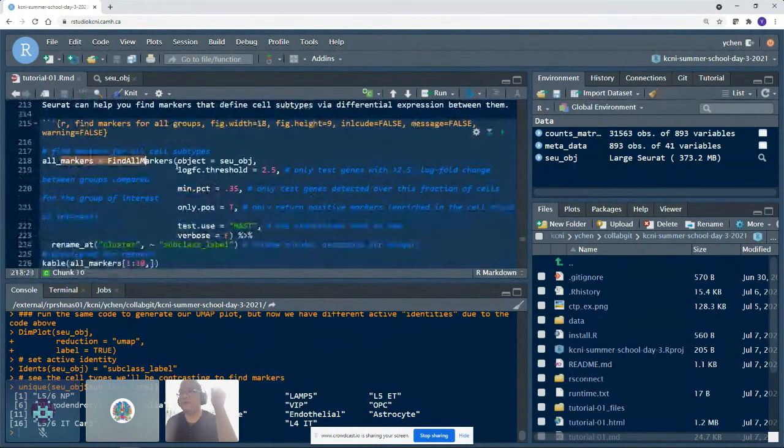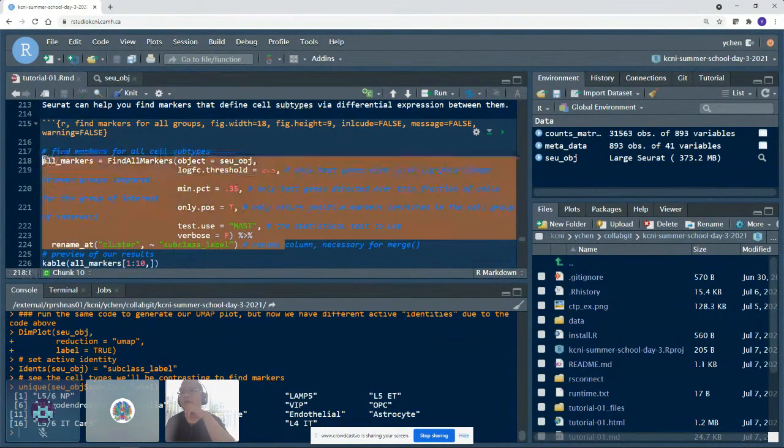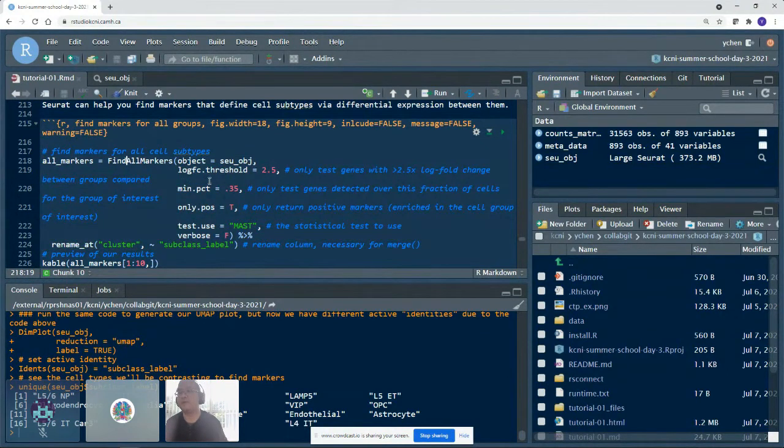This is the line of code, right? Warning, warning, blaring, signaling here. Try to be very clear here. This is the line of code that will cause people who are using Binder to either take a long time or hang or crash. Do not run this line of code if you are using Binder. I am not using Binder, so I'm going to just run it.